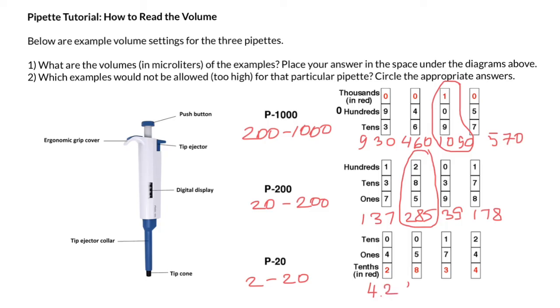Second one, 5.8 microliters. Next one, 17.3 microliters. And the last one, 24.4 microliters. And as you see, all of them are within this range except the last one, which exceeds 20 microliters and shows 24.4 microliters.